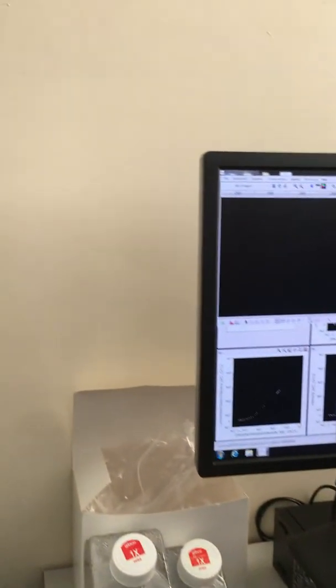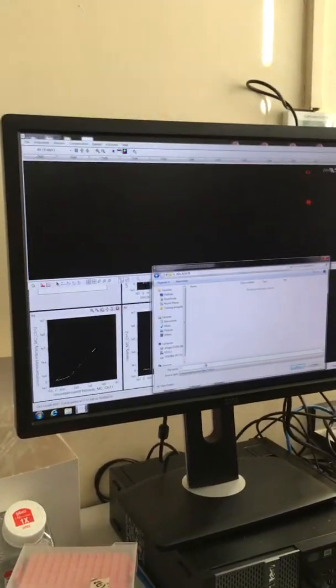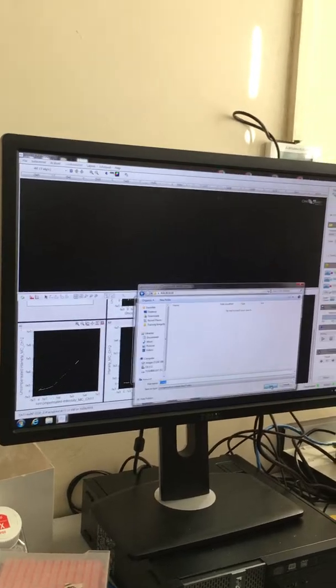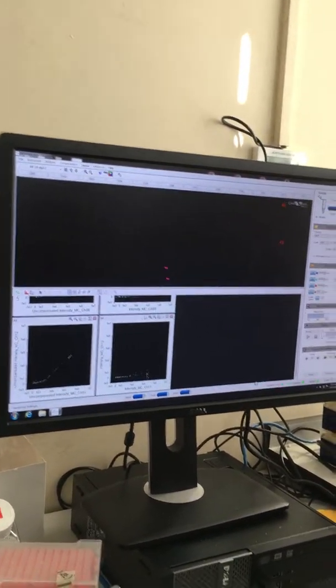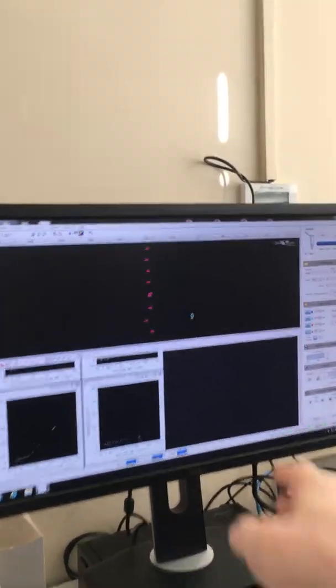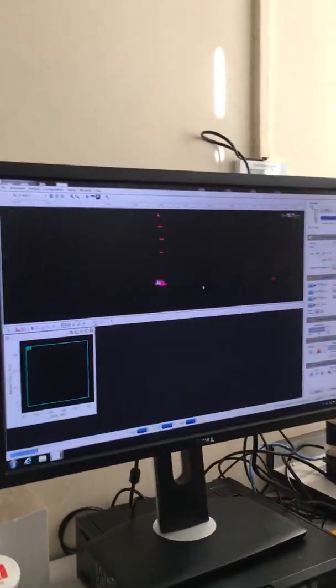And you need to name the file. So file name. Just call it comp. Okay, good, so that's done. You save it immediately. Now give it a second. It needs to see everything's grayed out still. There we go, now it's done. So now you need to return your sample. Press return.